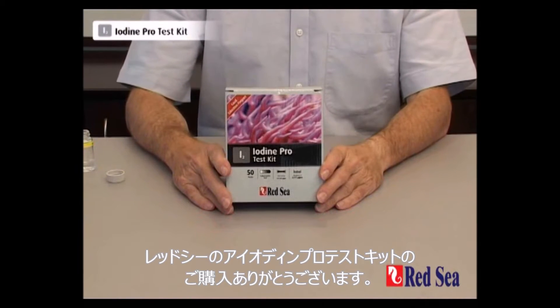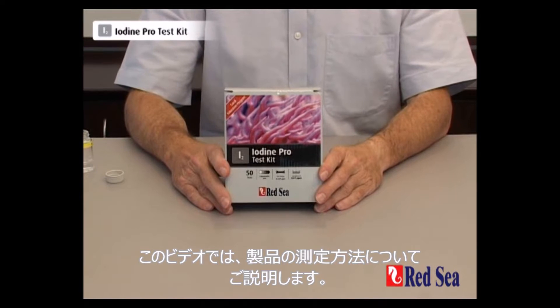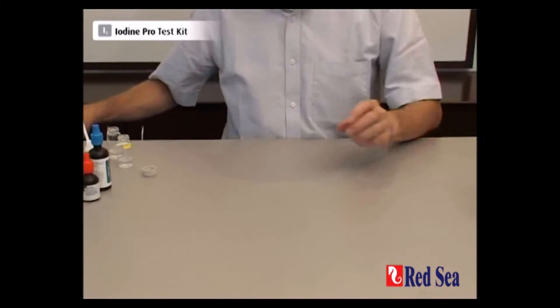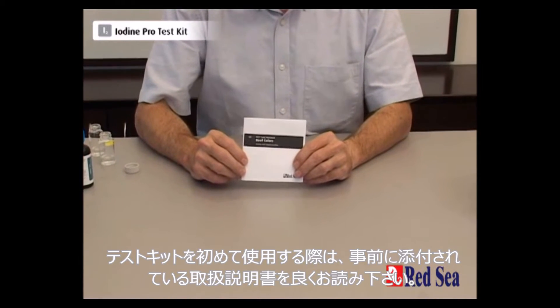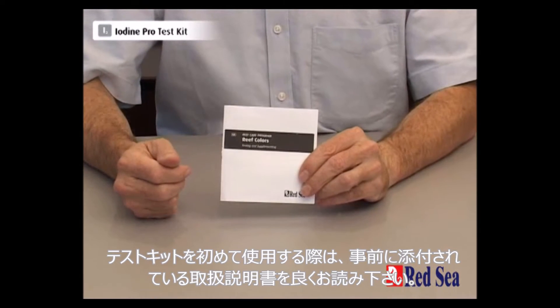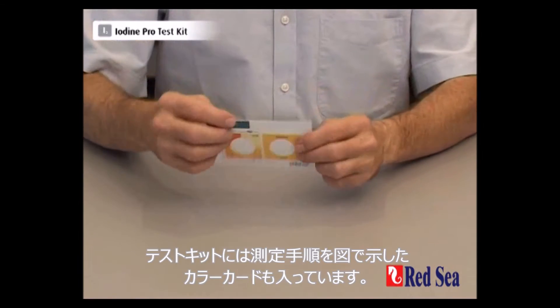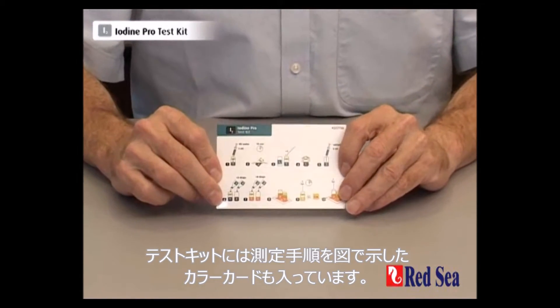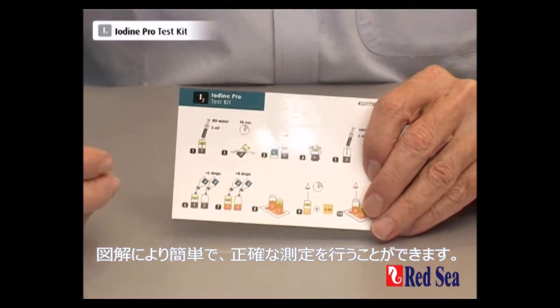Thank you for buying Red Sea's iodine pro test kit. The purpose of this video is to demonstrate how the test is performed. Before you do the test for the first time, make sure you read the instructions that are in the manual provided with the kit. We also provide a set of graphic instructions that make it easy to follow while you're actually performing the test.